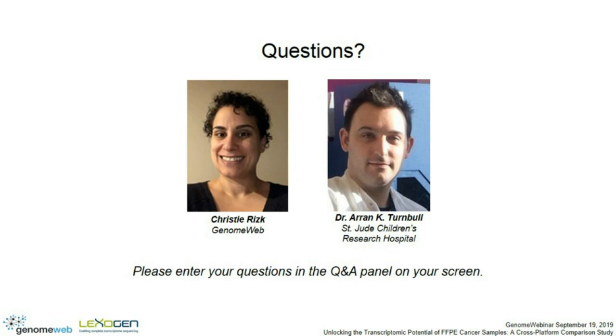Yes, and in fact, we actually did that. As I said before, the purpose of this was not a comprehensive study. We were actually generating data to address specific research aims of our own. So we analyzed a number of these data sets, specifically the large Lexogen data sets, absolutely independently, and then included all the transcripts, not just those that were common to all the other platforms. And most of the analysis that we have done, essentially replicating the characterization of endocrine therapy response we performed previously on fresh frozen tissue, we were able to replicate that using the whole genome QuantSeq data.